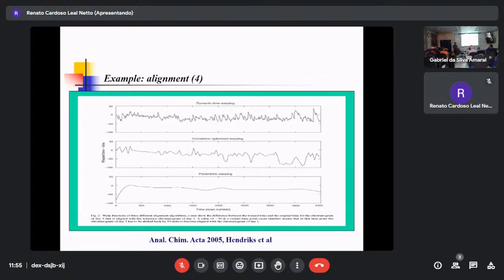Do you know the concept of calibration? Calibration and warping. Have you heard about calibration, right? Any kind of machine, you have to calibrate. Calibrate means you decide on one signal and move it, and then all the signals should move by the same degree as I did. That's calibration. I move all the signals like this.